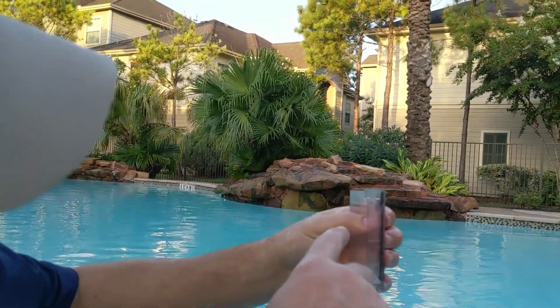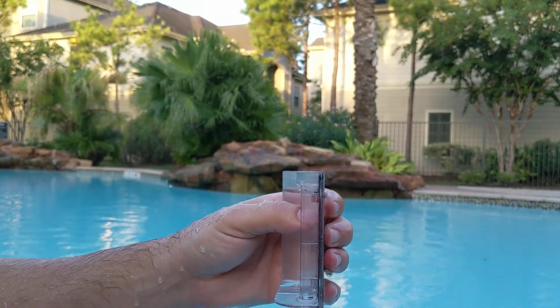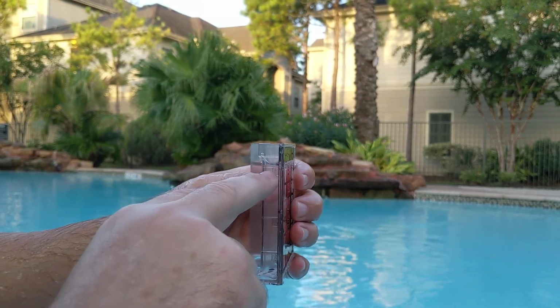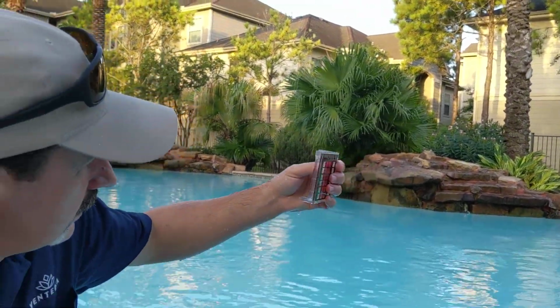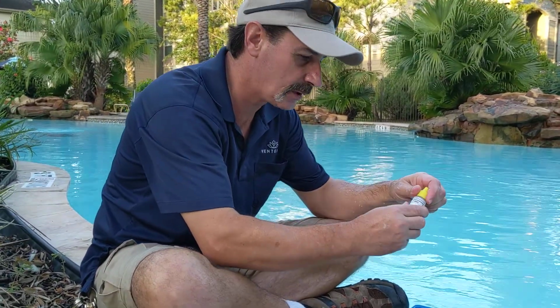Now, if you look here, you can see that the surface tension of the water kind of makes a concave on the top there. You want the bottom of that bubble. It's not really a bubble, but you want the bottom to be right there at that line. And that's pretty close. We can probably get it a little closer. That's pretty good. So, what we're going to do is take 5 drops of agent number 1.